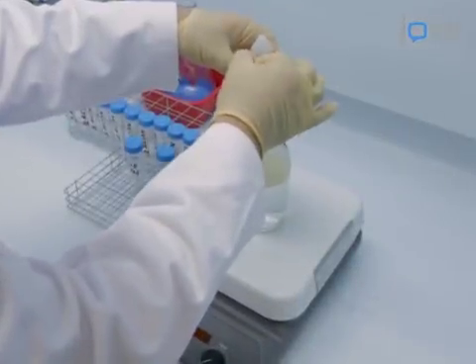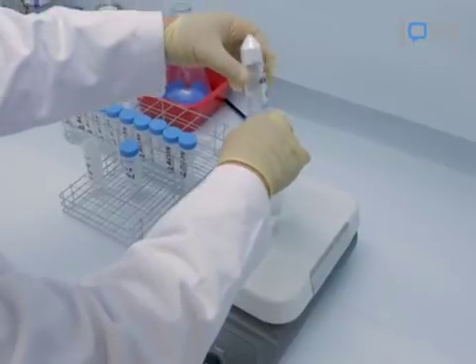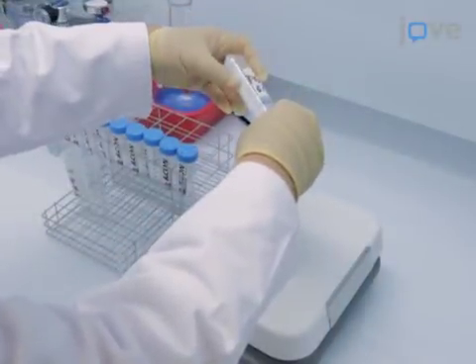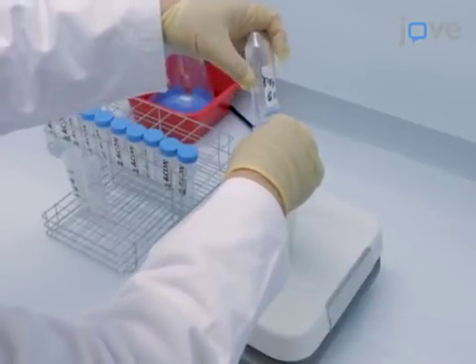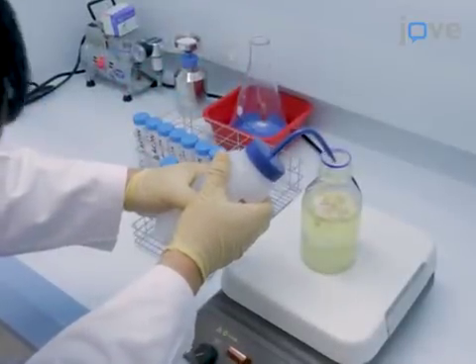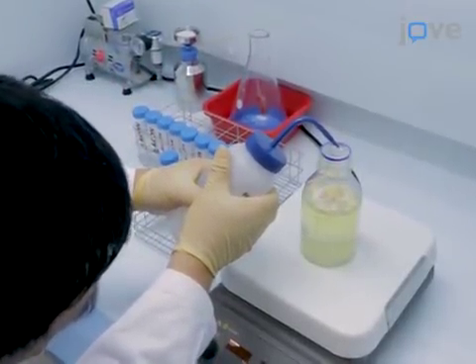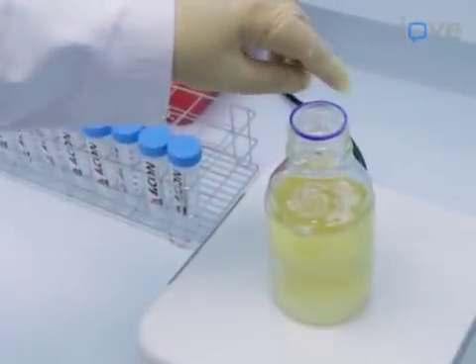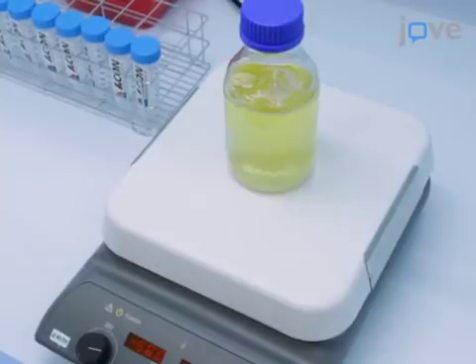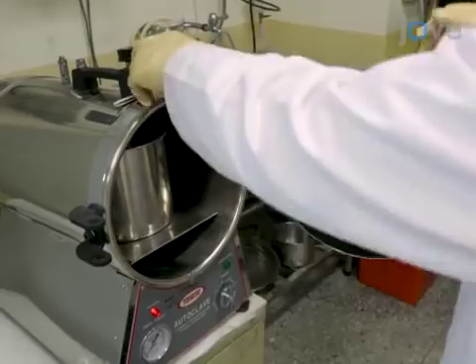Place 10g of LB Lennox broth, 10g of sodium chloride, and 10g of glucose into a 500ml laboratory bottle. Then add water until the volume reaches 450ml. Add a Teflon stir bar and stir for 20 minutes. Once mixed, autoclave the solution at 120°C for 10 minutes.